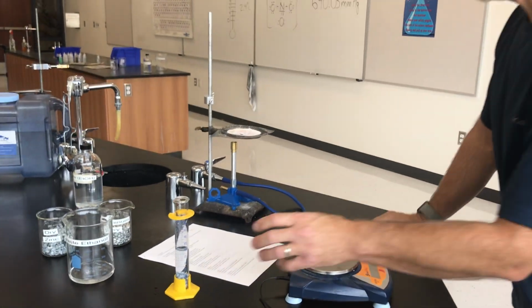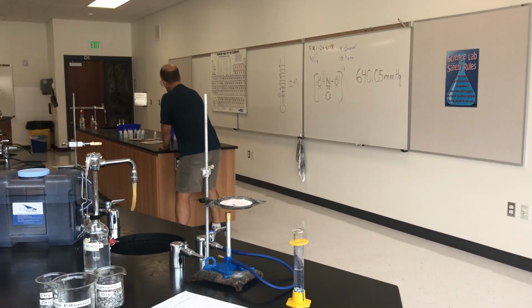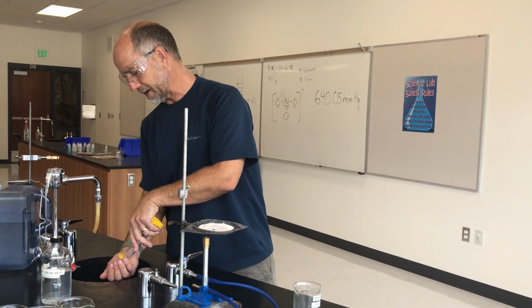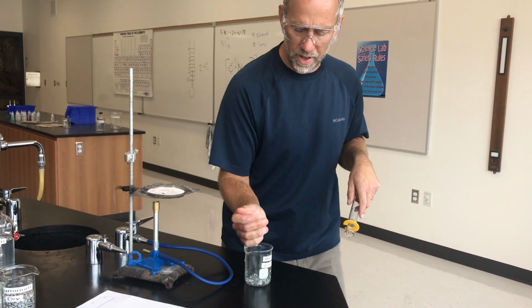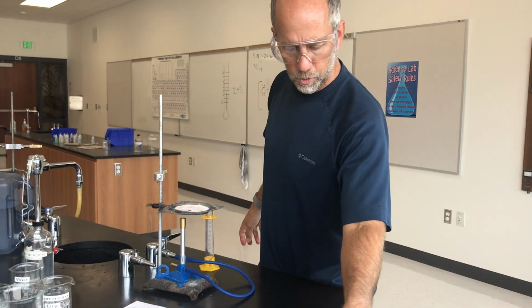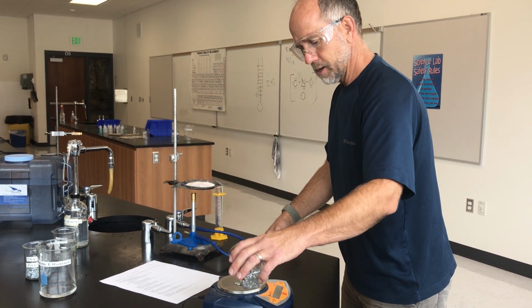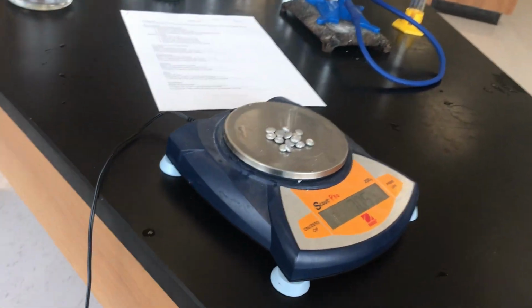Okay, now it's going to take us just a second to clean this up. There is a beaker where we will collect the wet zinc. We will pour this off, collecting the metal, placing then the metal in the wet zinc container, and we will now carry out the same procedure with aluminum. So we'll re-zero the balance. We will get 8 or 10 maybe pieces of aluminum, weighing those pieces of aluminum.